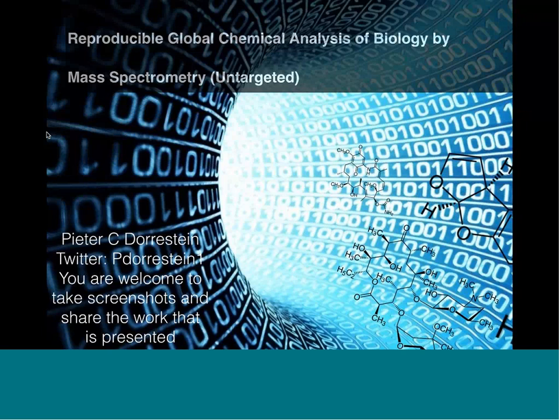There are some machine learning approaches that people have been using within a given project. I have not seen machine learning happening at the global scale, but the time is right for that to start happening. And that's exactly why it's so important to have the data in the public domain, and annotations in the public domain, so that we can begin to do machine learning.